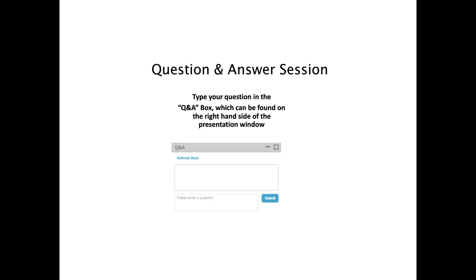Excellent. Another question just came in. Does this detector work for aqueous polymers or polysaccharides? Yeah, so that goes to the previous question we were discussing earlier. There's a very good body of literature for using online viscometry for aqueous polymers, such as polysaccharides, so it's a very good application. It's very much equivalent to the polymer applications we were showing, but in aqueous solvents. And yes, it works very well for that.